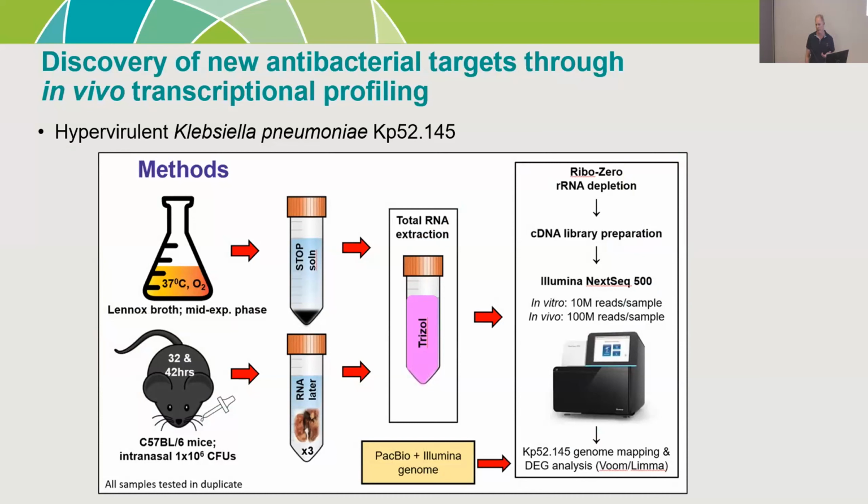RNA-seq is basically us sequencing the messenger RNA across the entire genome that's generated by either a culture. So this study was really a drug discovery type of analysis. Effectively, we had an intranasal lung infection model in mice, and we let the infections evolve for about 32 to 42 hours. If we leave it too long, they actually fall over, unfortunately. So this is like 2 slides of about 5 years' worth of work.